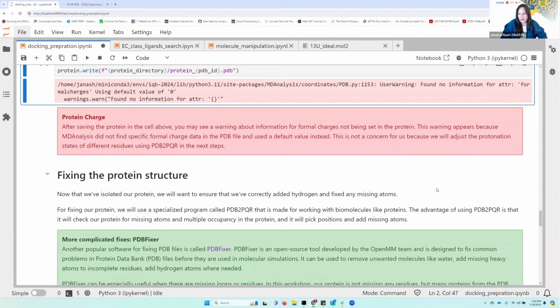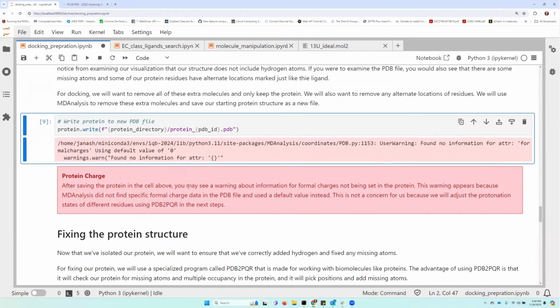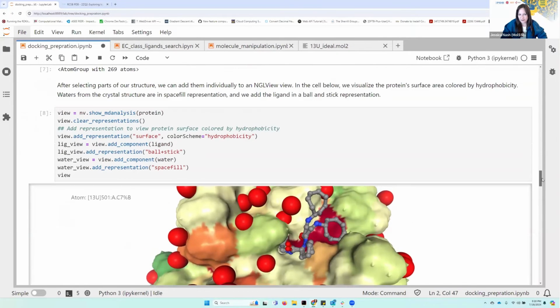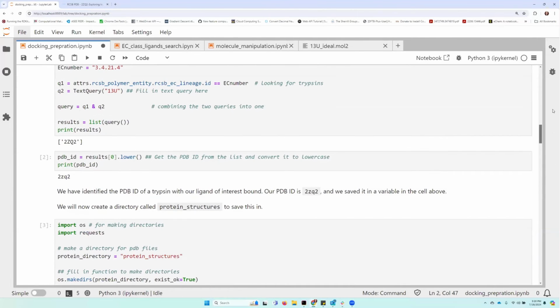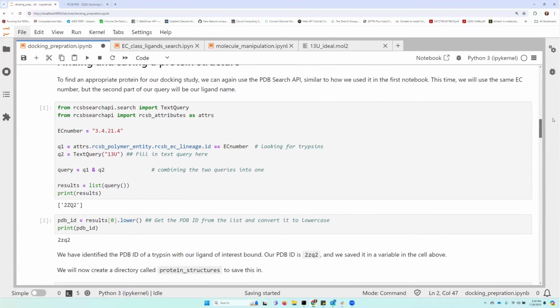So now that we have that Jessica? structure, yes. There's been a few requests to slow down just a bit and recap what we've done up to this point. Okay. Do you have any idea of where we need to go? Maybe just a slow walkthrough of what each of the steps did is probably just run through what each of the blocks did. Don't necessarily like repeat everything, just what we did up to this point, I think should help.